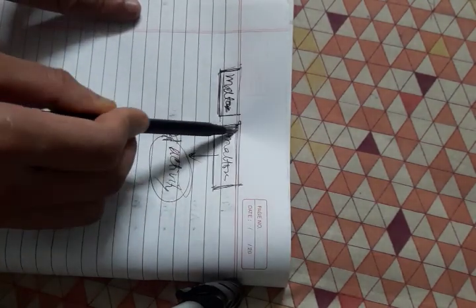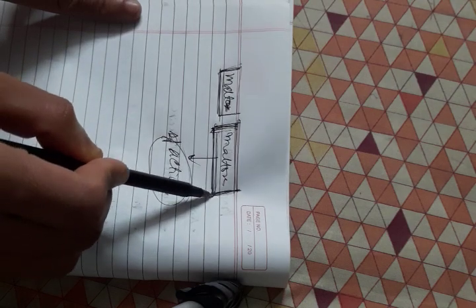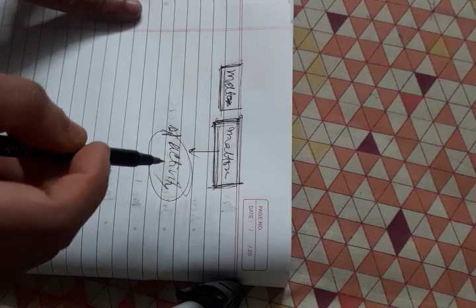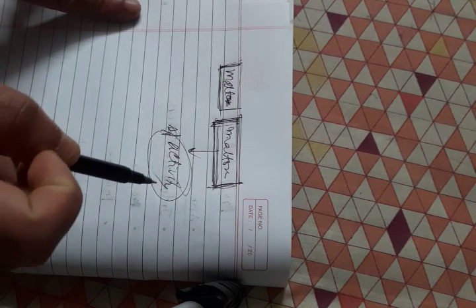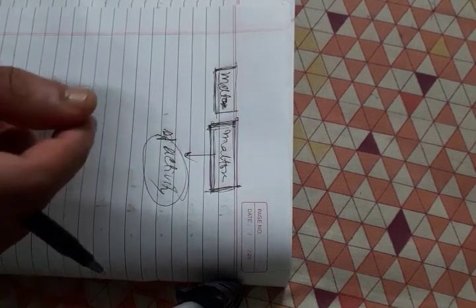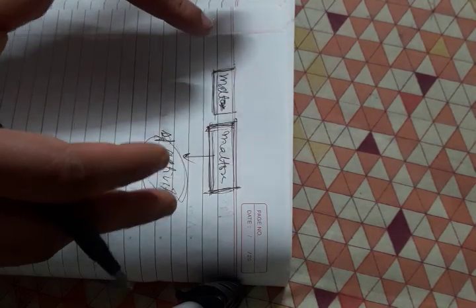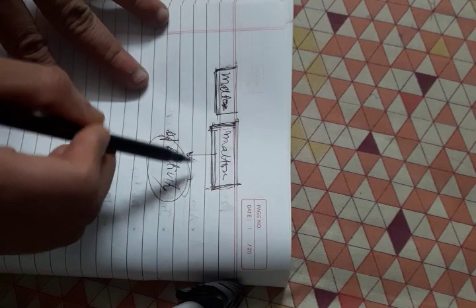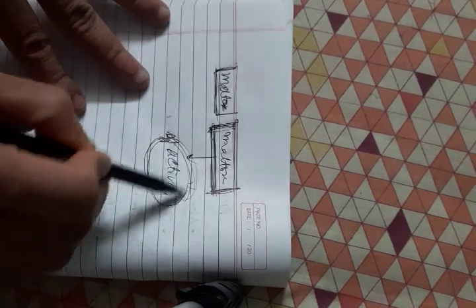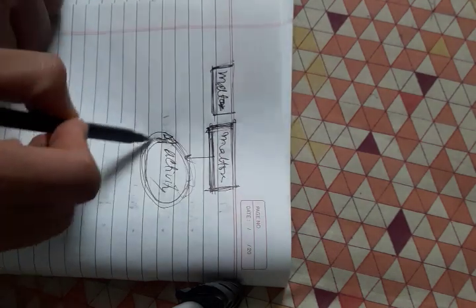If we calculate the amount of maltose in the solution after a specific given time, when the amylase is allowed to degrade the starch, then the amount of maltose produced tells us what amount of activity that enzyme is showing.